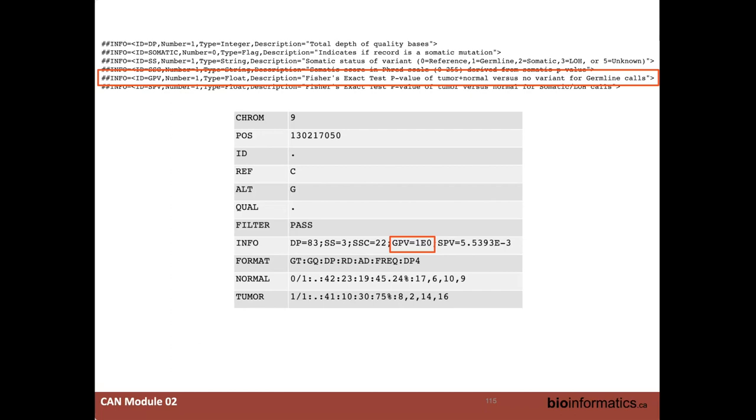This, again, is going to be very, very tool specific, and it's going to be covered a lot more. I believe this is module 4 for variant analysis. But I'm just explaining to you that if you do get yourself a VCF file, don't be worried about these info strings, because you can actually look that information up, at least for what it means, not necessarily how it's calculated.